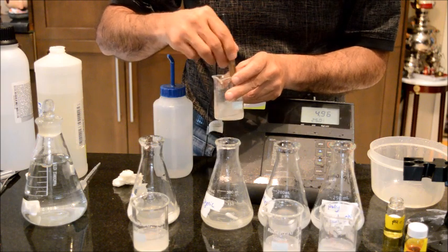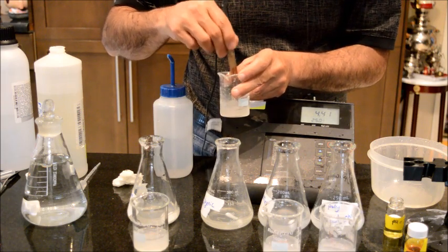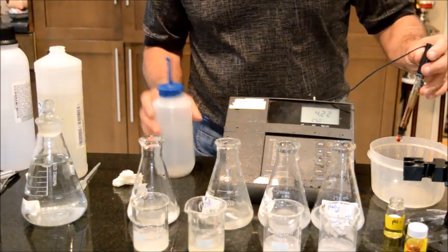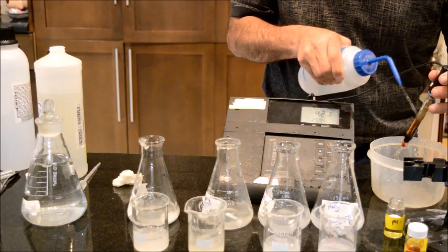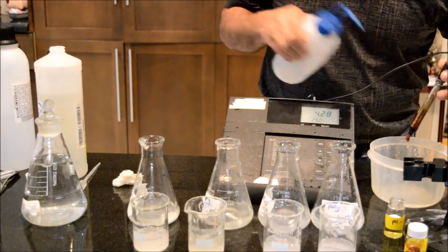Again, I don't want it to be exactly the same, as long as it's close enough. I think that's as good for this video. So this is around 4.2. This is the target. I'm going to clean this.